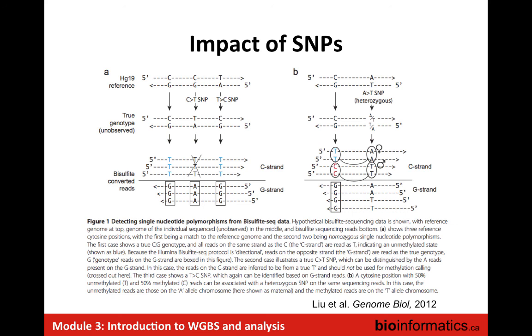So far, every time I was talking about the reference genome, and you've got the C's that might be T's, and you're converting the sequences, and all of that. I mean, arguably, I thought it was complicated enough, unless I explained it so well that it's all very clear to you guys. At least it's in the morning, it's not late afternoon.